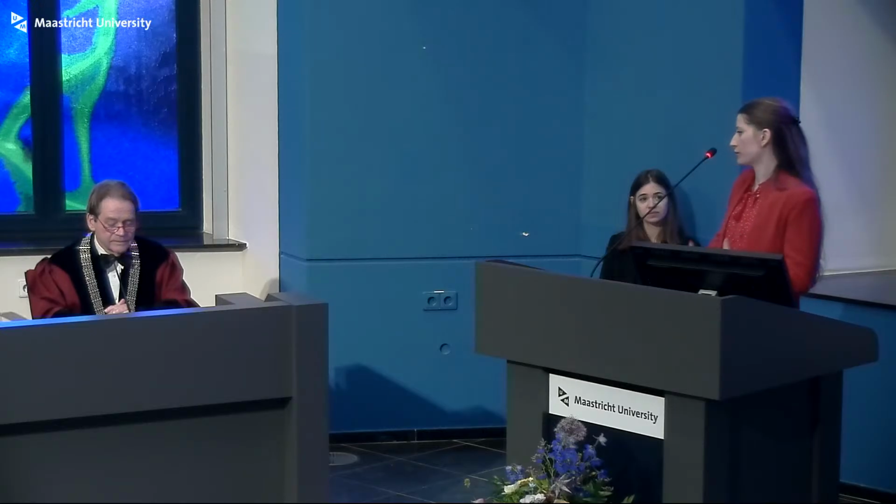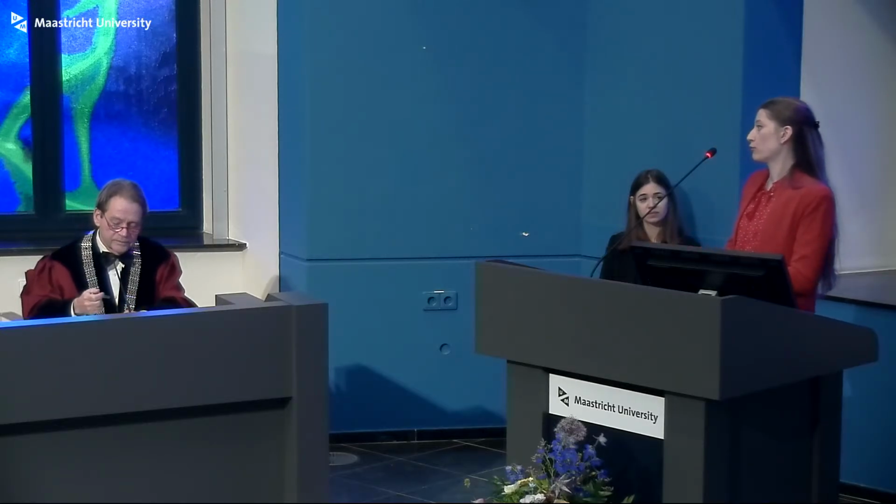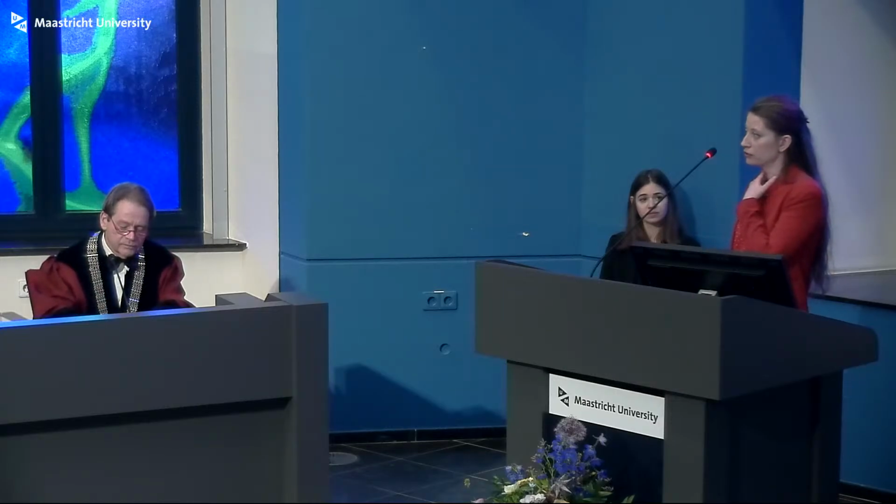Yes, well, I think that generally in screening drugs, they go for high throughput, and the standardization of the process is very important. So for this first screening, we used the vasculature model because it's the most used in the company. It was one of the first that the company came out with, so we know the model quite well, and it was already automated, because the seeding was done with the robot. But how can you make it better? Of course, the next step will be to use disease models, because if you have to find a treatment for a disease, it's good to start with the disease model.